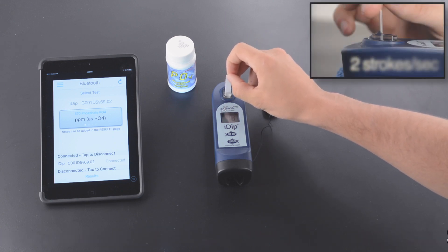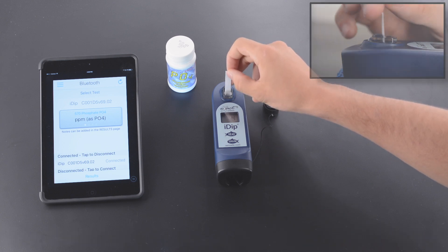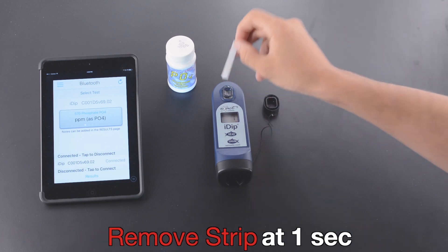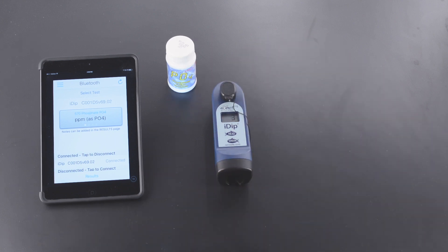Dip the strip for 20 seconds at two strokes per second. Remove the strip at one second, replace the tap, and wait 120 seconds.